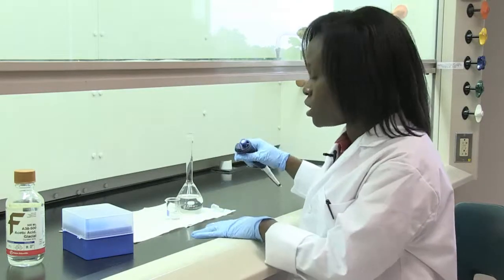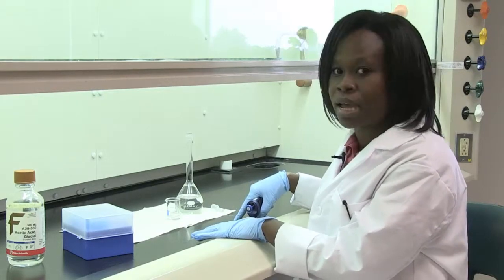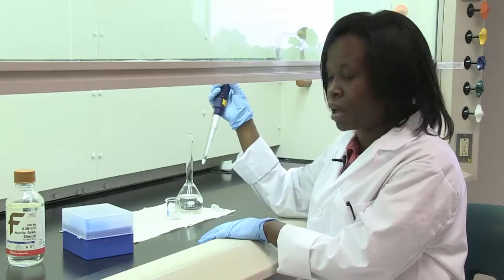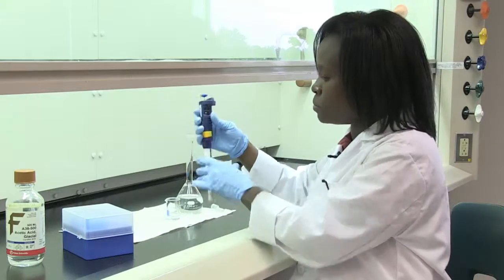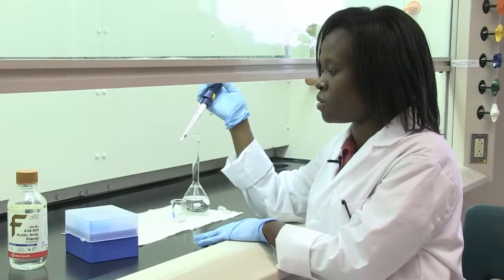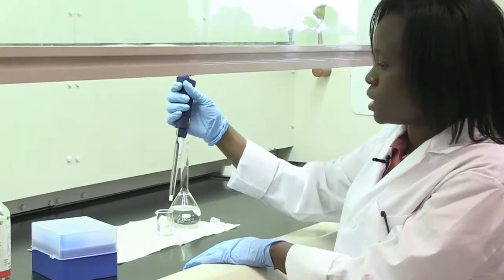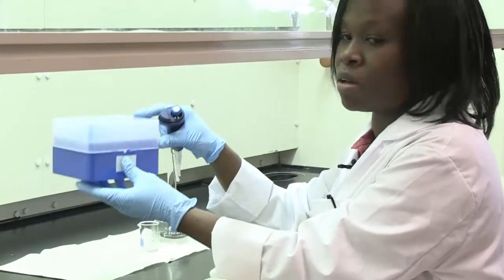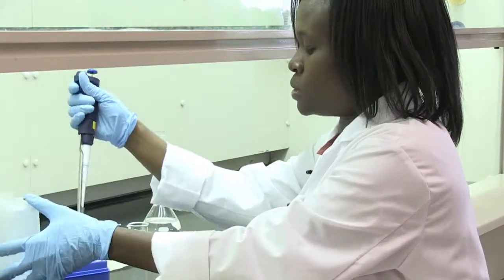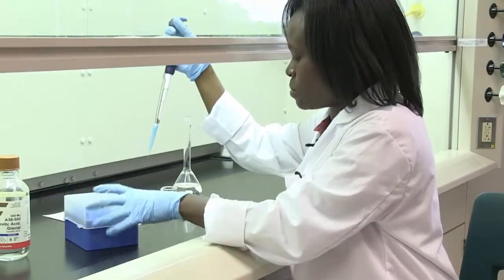The volume that I'm going to add to my flask right now is 1.429 mL. Since it's a small volume, I'm going to use a micropipette to do this. Micropipettes are used for measuring small volumes from 1 mL down to below a mL. It works with micropipette tips, which come in these containers. You open your box of micropipette tips and securely place the tip onto your micropipette.